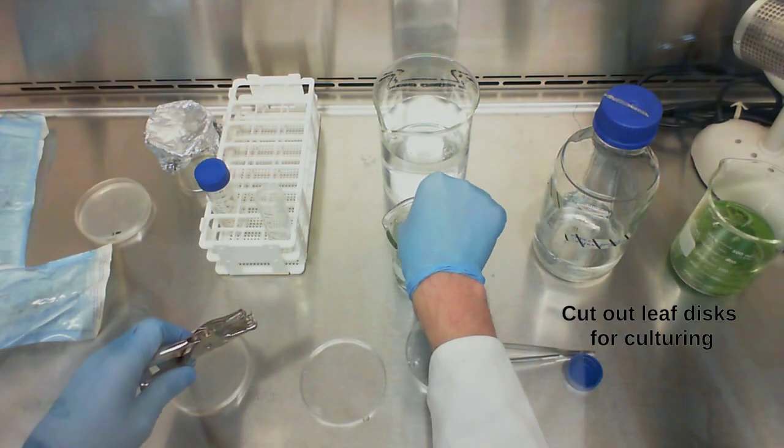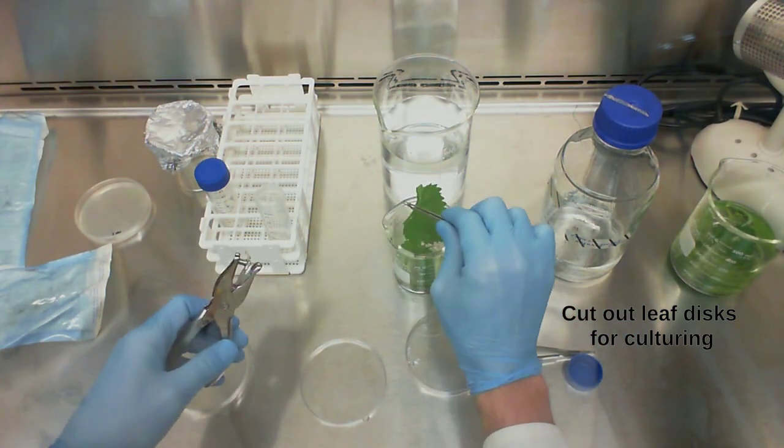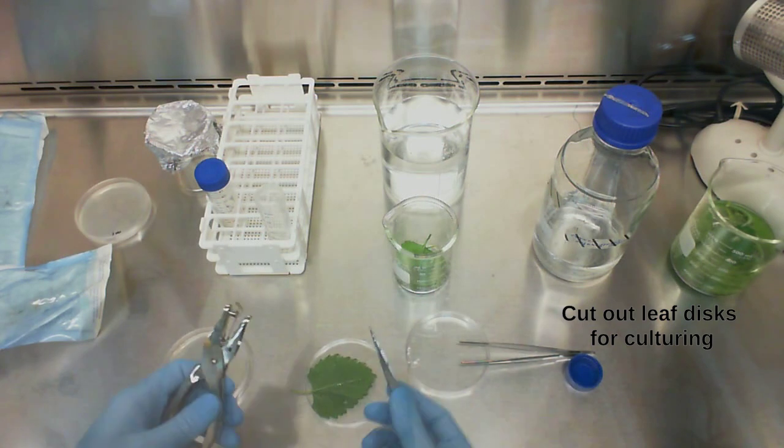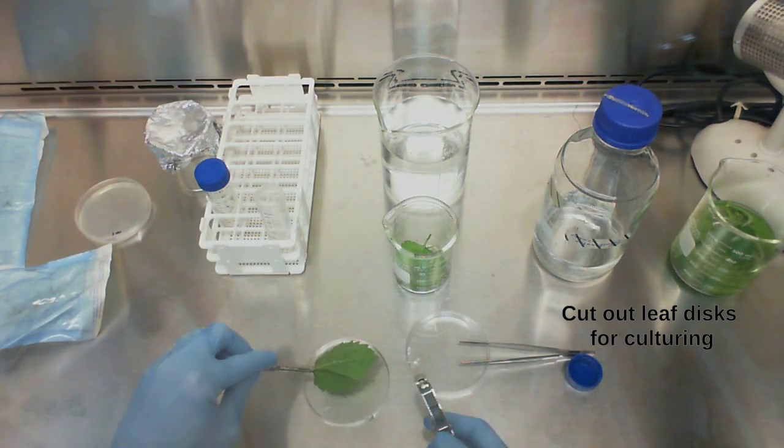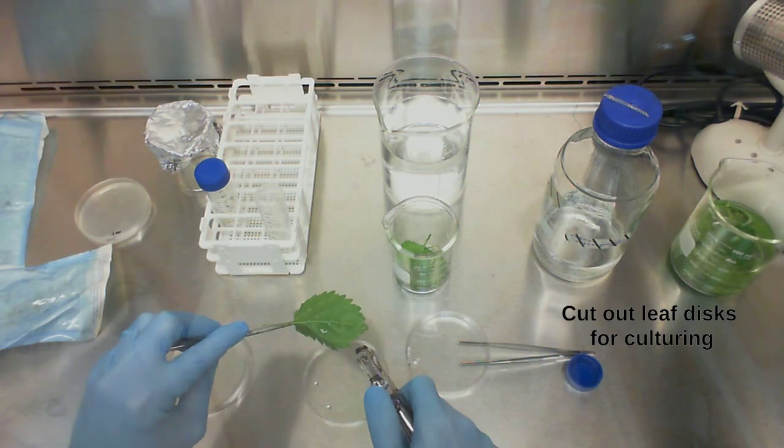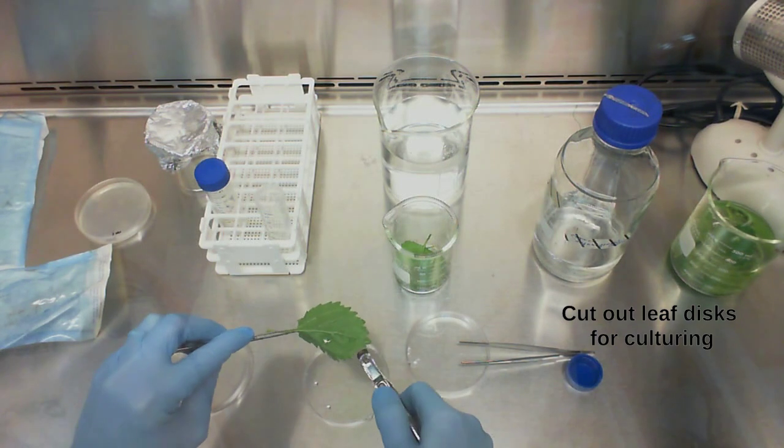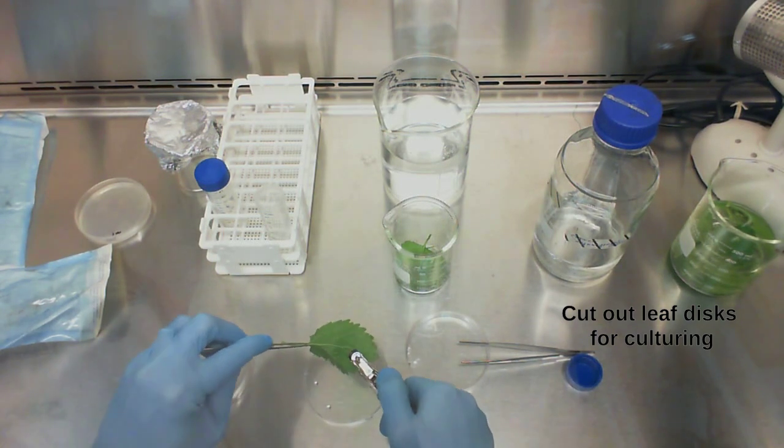I'm going to take one of my leaves. When you are trying to generate calluses, what you want to do with a leaf is try to make a hole or make a cut that's going to incorporate one of the veins.